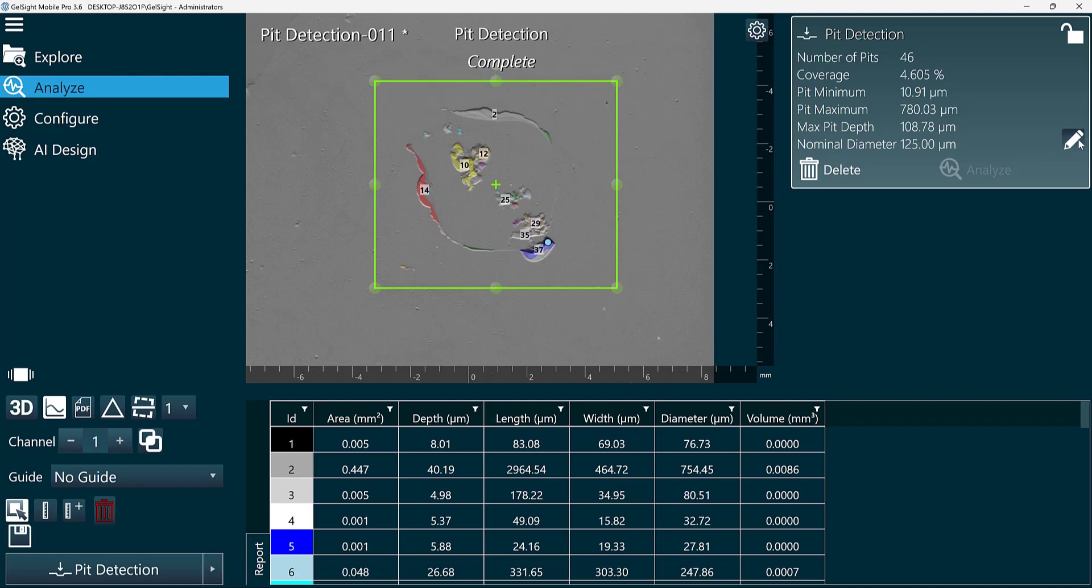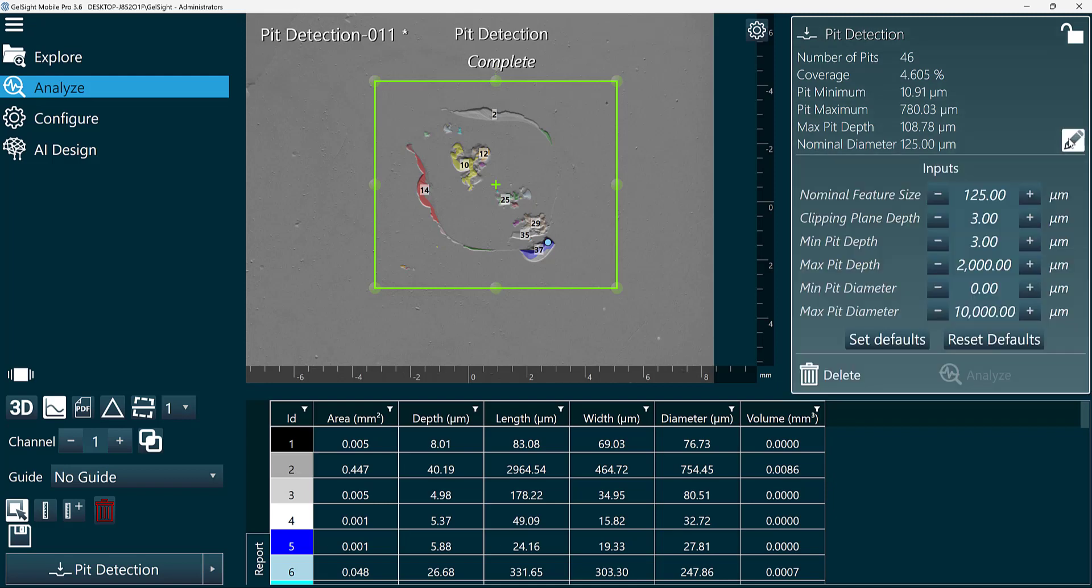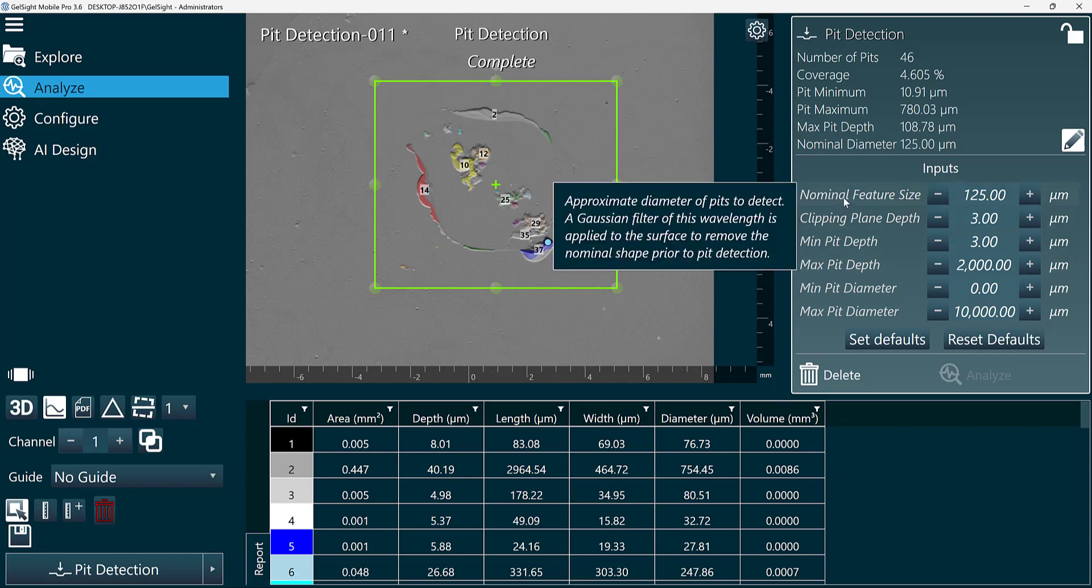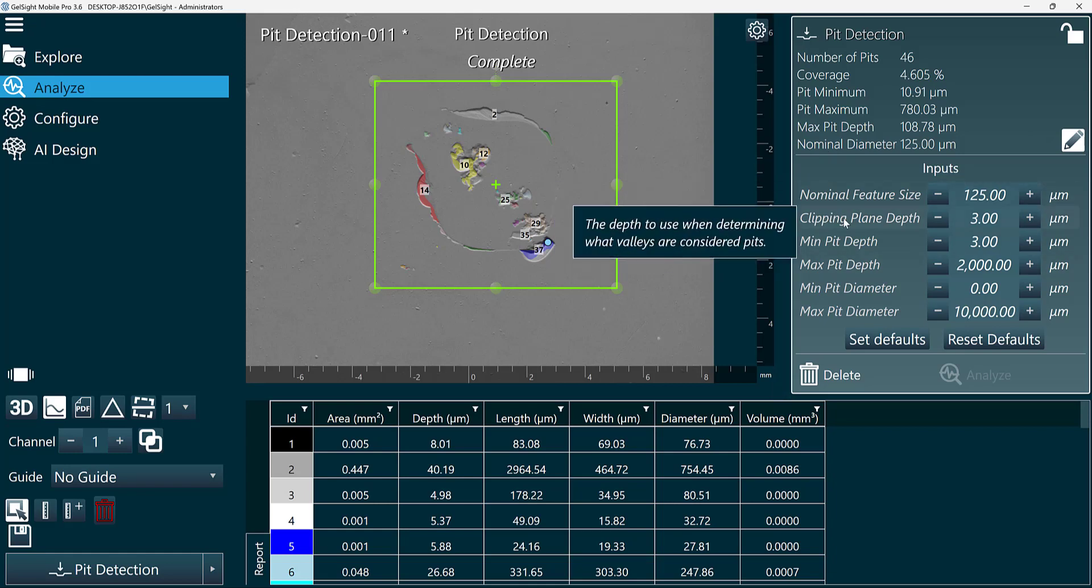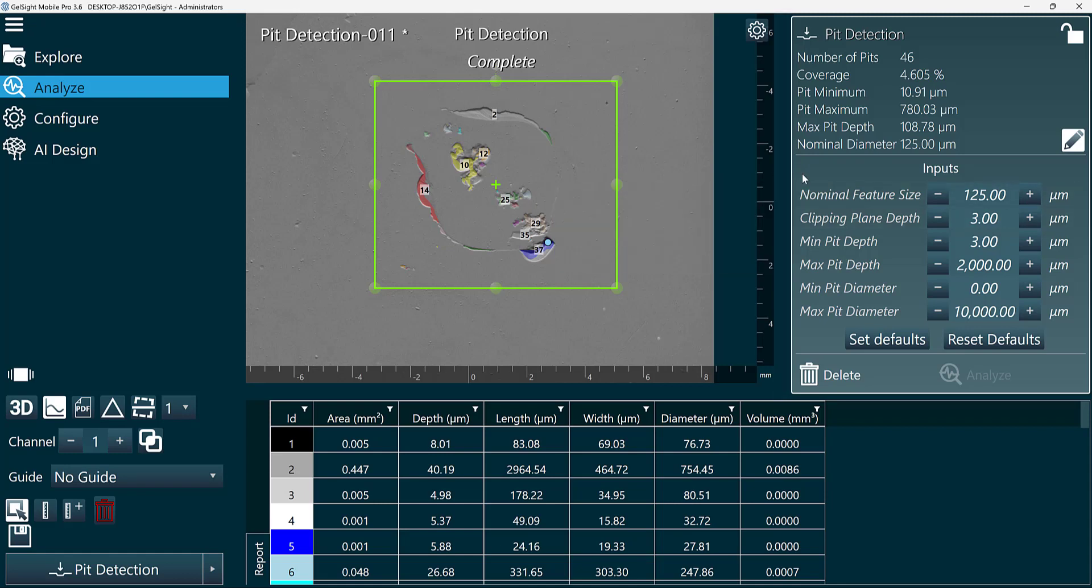If I select the Advanced Settings pencil icon here, we can open that up and see what input parameters we have. We can set the nominal feature size and the clipping plane depth. These two parameters are used by the algorithm to help find the pits in the region of interest.